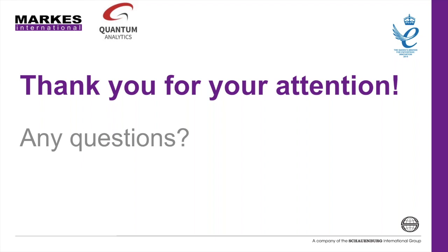Okay, just trying to think quickly on this question, and I might be messing that question up. Can you just repeat the question quickly, Lauren? Otherwise, we'll have a look offline. Maybe this was actually more of a statement. If you load internal standard prior to splitting for recollection, no adjustment will be needed to account for the split.